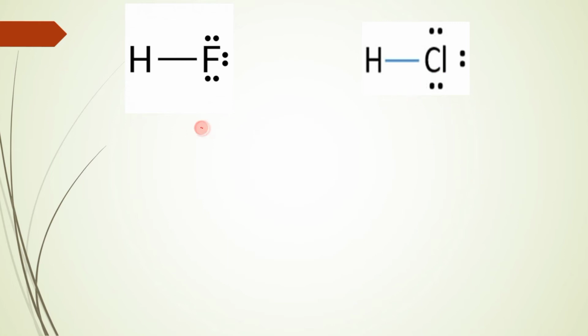So thus the sigma value, that is the shielding parameter, and the magnetic field the nucleus experiences will also be different. From the sigma value, we can predict which functional group would be present in that particular position.